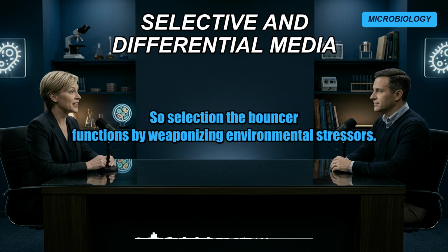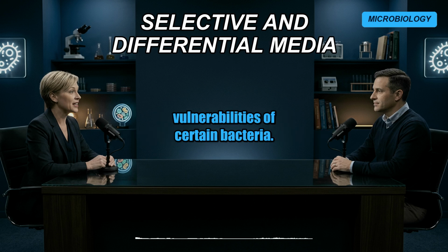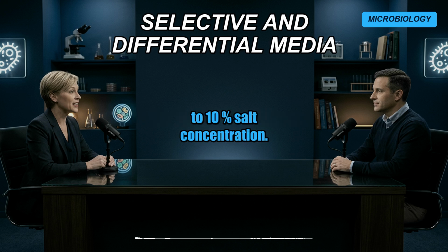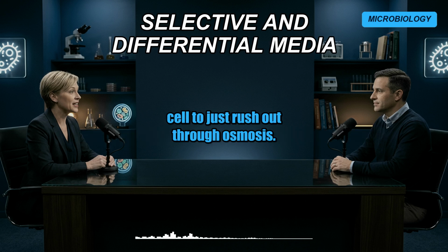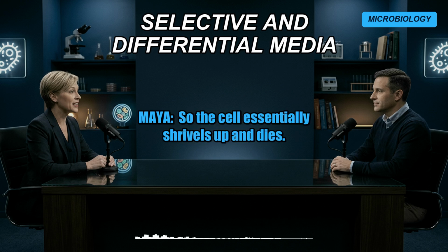Okay. So selection, the bouncer, functions by weaponizing environmental stressors. The agar is spiked with ingredients that exploit the structural vulnerabilities of certain bacteria. Take mannitol salt agar as an example. Okay. The lab pumps the agar full of a 7.5 to 10% salt concentration. If a typical bacterium lands on that plate, the extreme salt environment causes the water inside the bacterial cell to just rush out through osmosis. Because it's trying to balance the salt. Exactly. So the cell essentially shrivels up and dies.